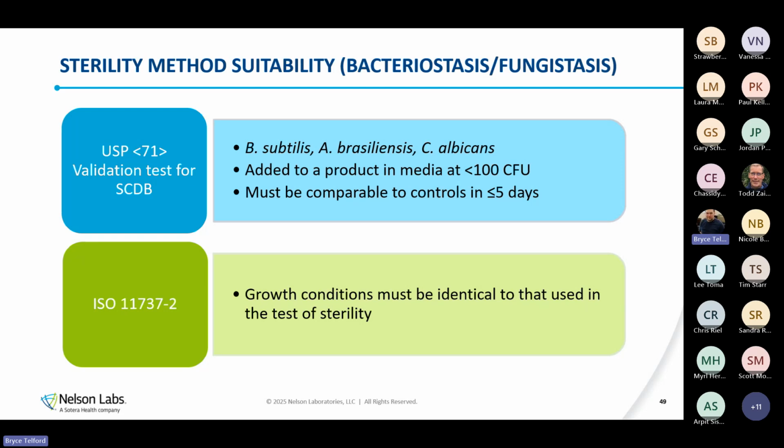If they do not grow, then that is an indication that that product, as tested, is inhibiting those microorganisms. That means when we have a sterility negative, we don't know: is it a sterility negative because it's sterile, or is it a sterility negative because that organism just can't grow? So we're going to have to address that.